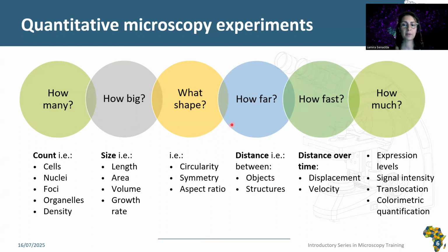In live cell experiments, one can report on distance traveled, the velocity at which the cell migrated, and the directionality of the movements. With the development of fluorescence techniques, the intensity can be measured, providing a means to quantify the distribution and levels of the labeled molecule.